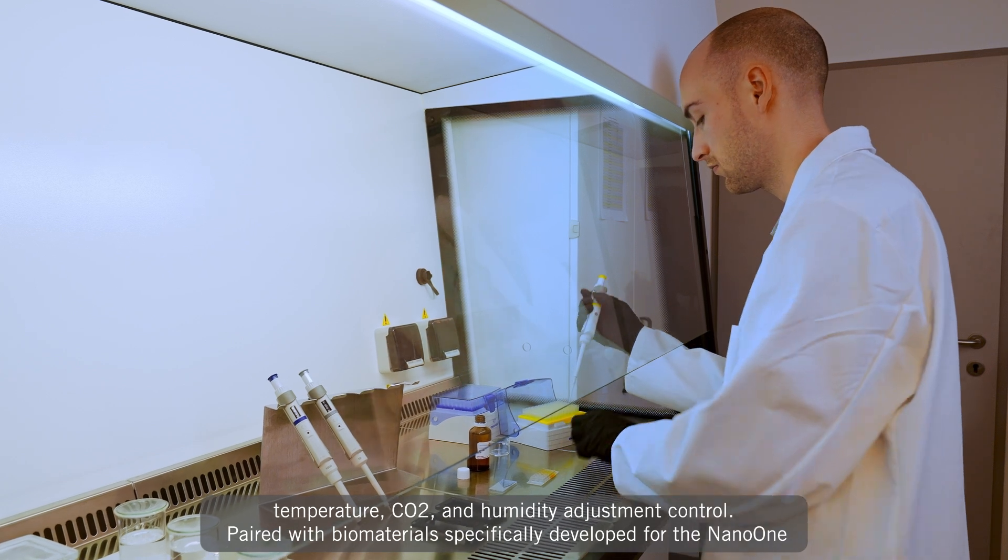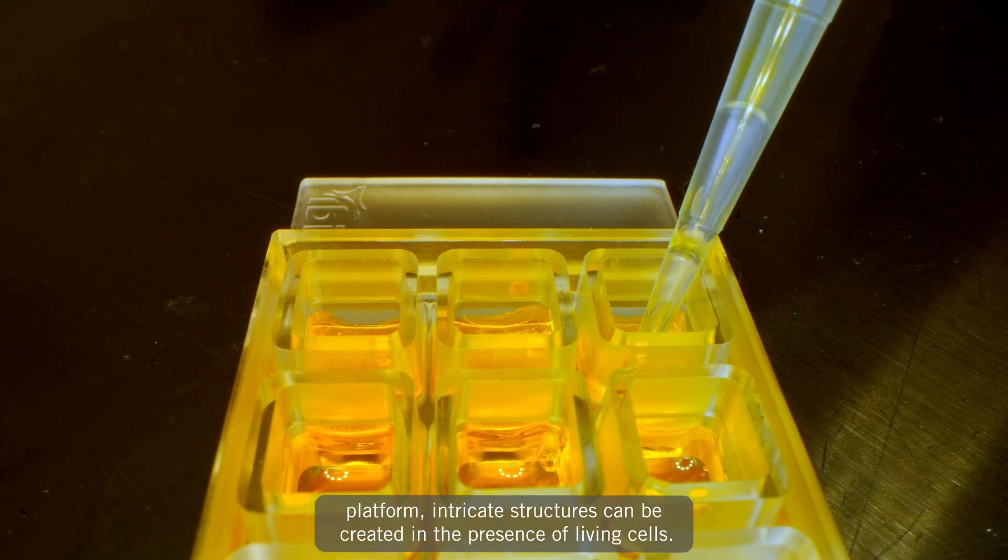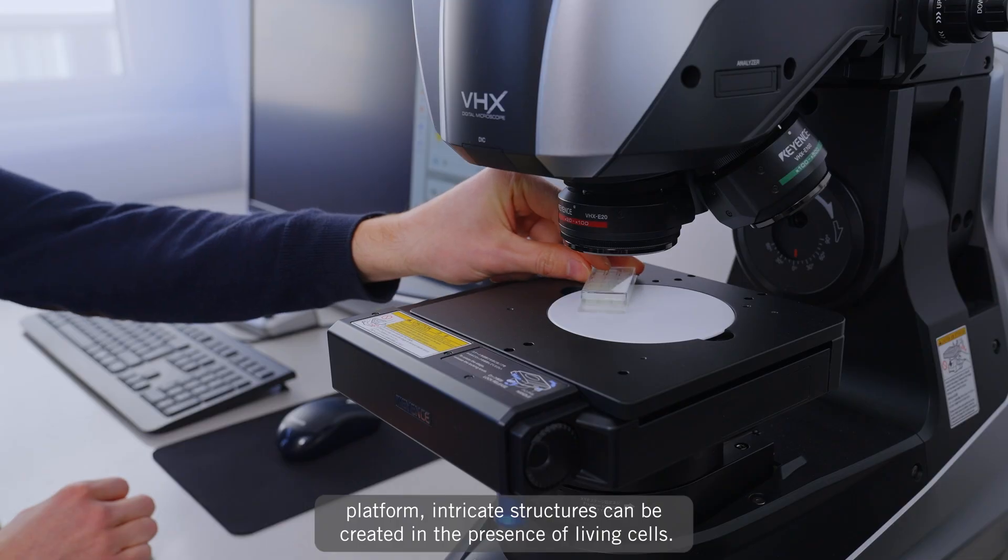Paired with biomaterials specifically developed for the Nano One platform, intricate structures can be created in the presence of living cells.